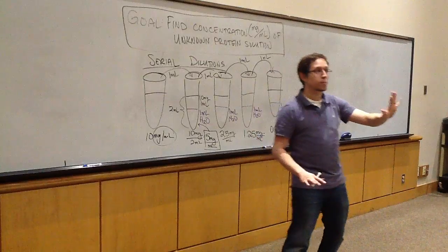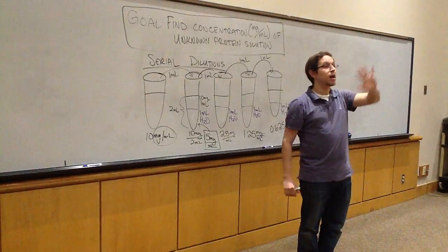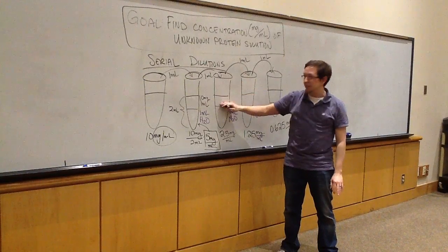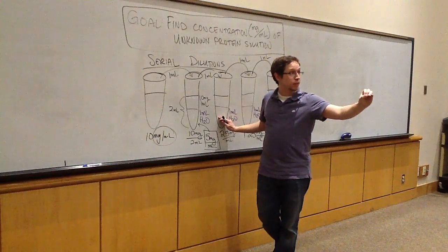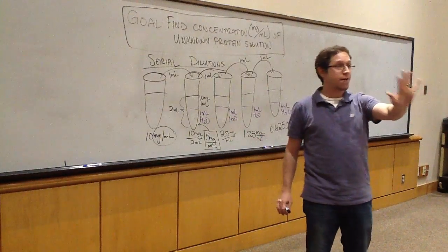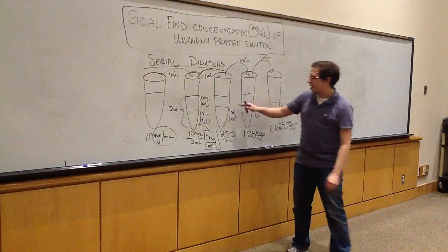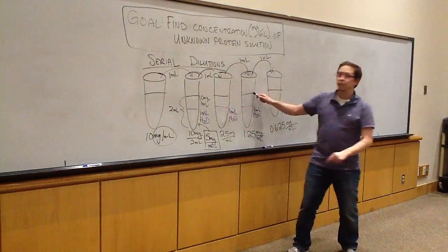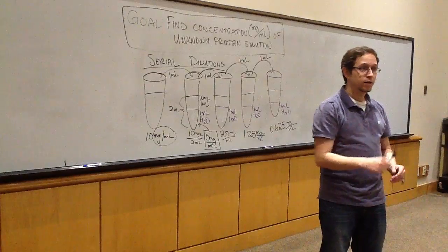5 milligrams per milliliter. Now if I take 1 milliliter out, I'm not taking out 10 milligrams, I'm only taking out 5. So I take 5 milligrams of protein out and I put it into this tube, which also had 1 ml of water, which has 0 milligrams of protein. So total in this tube, I have a volume of 2 milliliters, but I have 5 milligrams dispersed through that 2 milliliters, which means I have 5 over 2, which gives me 2.5 milligrams per milliliter. So every time I dilute, I go down in concentration by half. That work better? Okay, awesome.